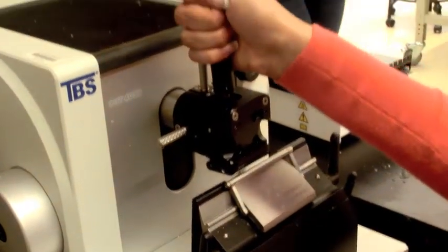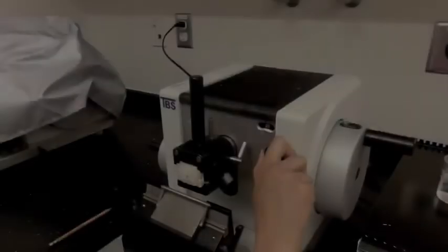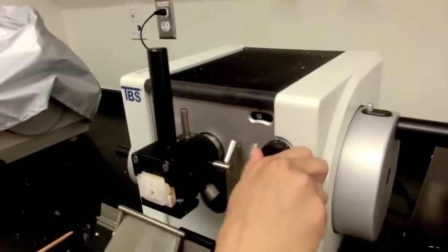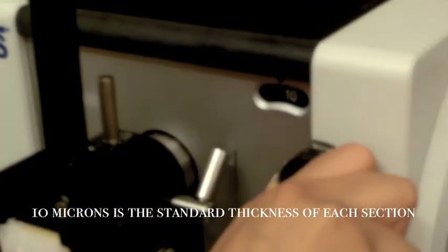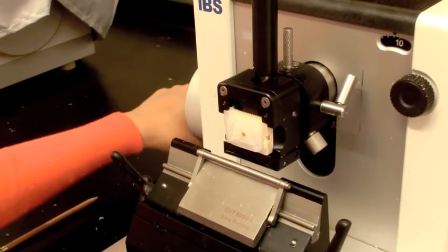When you are ready to section the paraffin-embedded organ, place the paraffin cartridge in the microtome while pulling the main handle towards you. Use the knob on the right to adjust the section thickness required for your sectioning, approximately 10 microns. Next, adjust the stage with the wheel on the left as to move the paraffin cartridge close to the microtome blade.